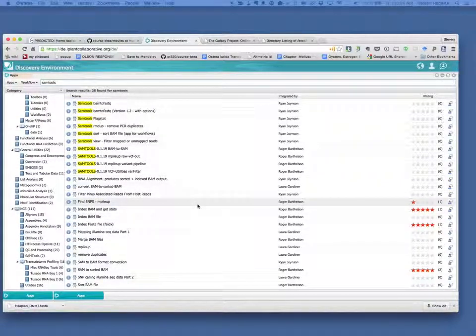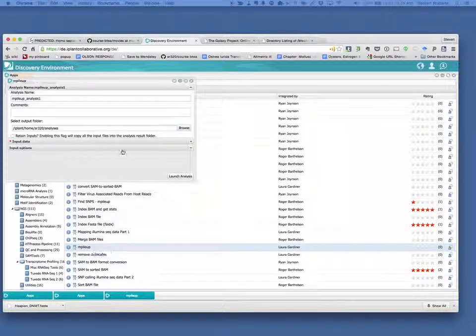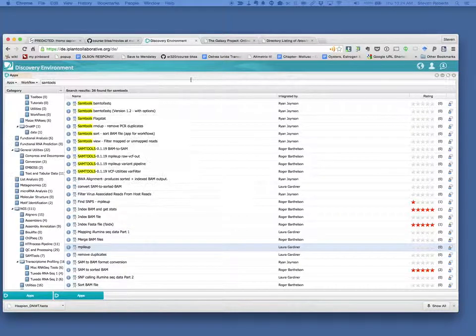It can do a lot of different things. mpileup is the one that actually gets it for calling the SNPs. Okay. You convert the SAM to BAM, so you would input it and you would run it. So I've already done this, so I'll just show you what it looks like.